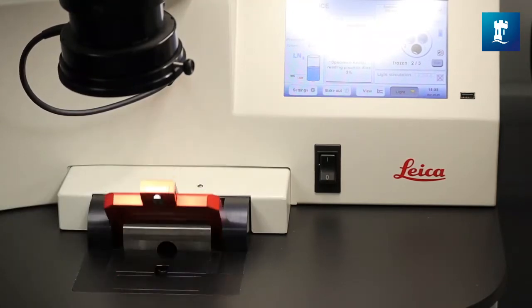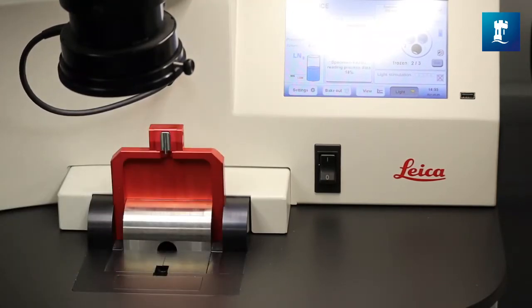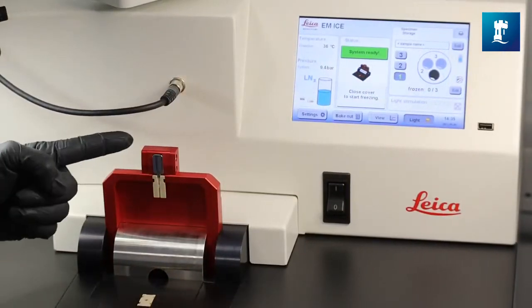To freeze you just close the lid and the automated process starts and it freezes the sample.